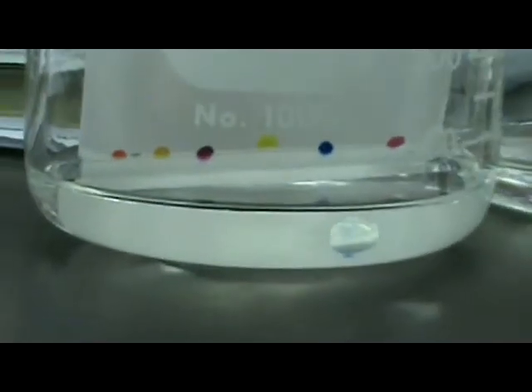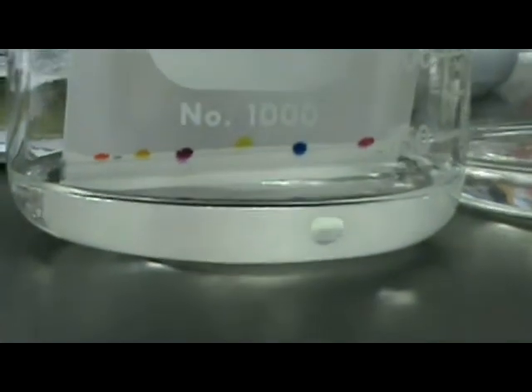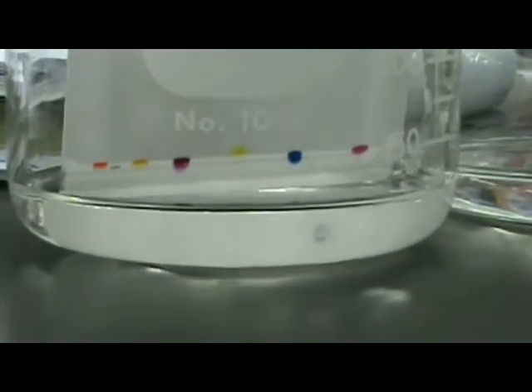So how much should I have poured? I already filled mine up. How far did you turn? You have to do it less than a centimeter. Alright, it's less than a centimeter. And it starts really soaking up. It's right on the line. All the color's gonna go up there.